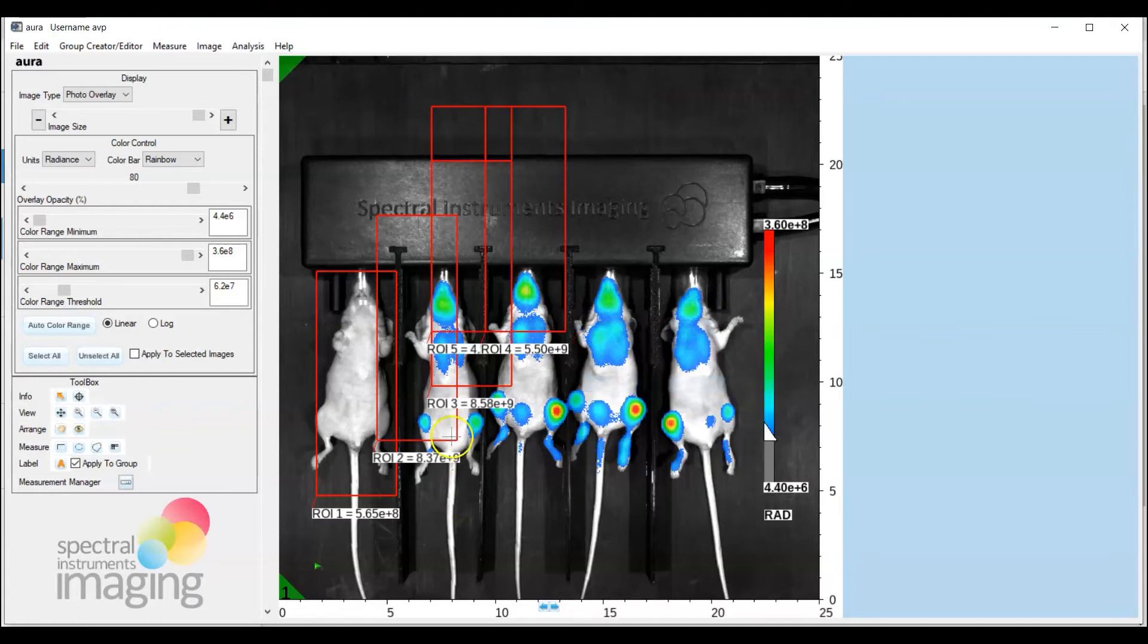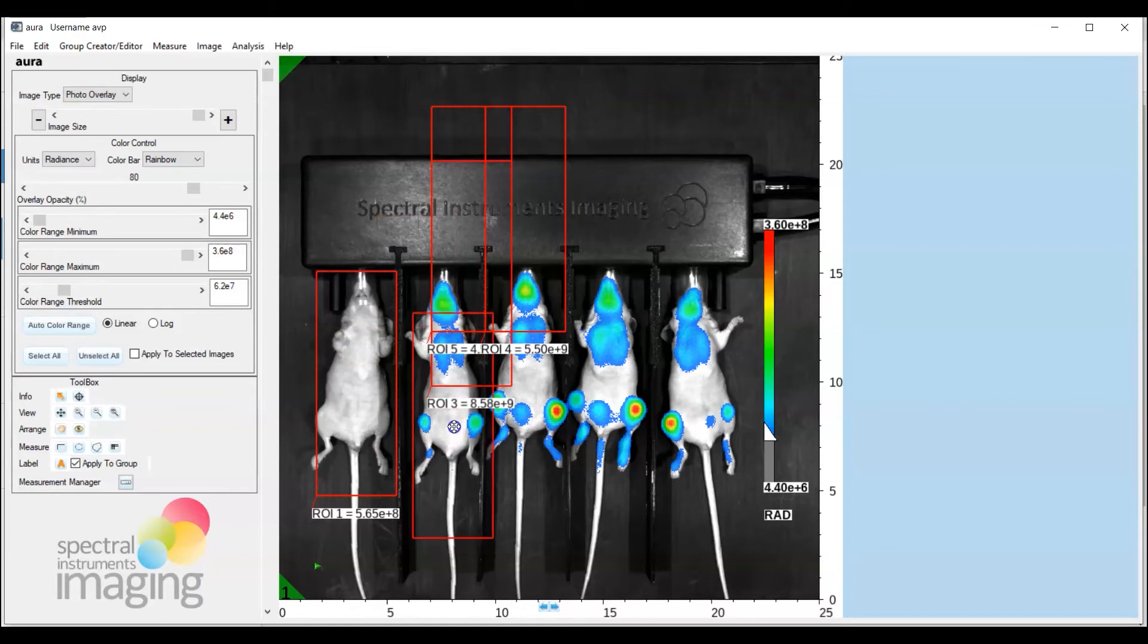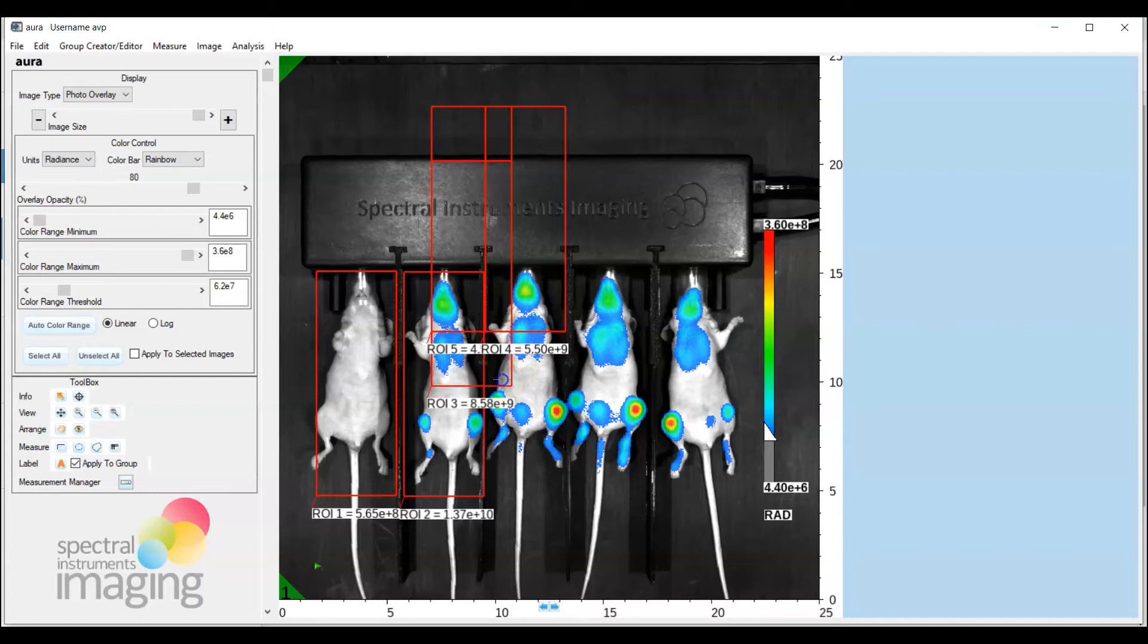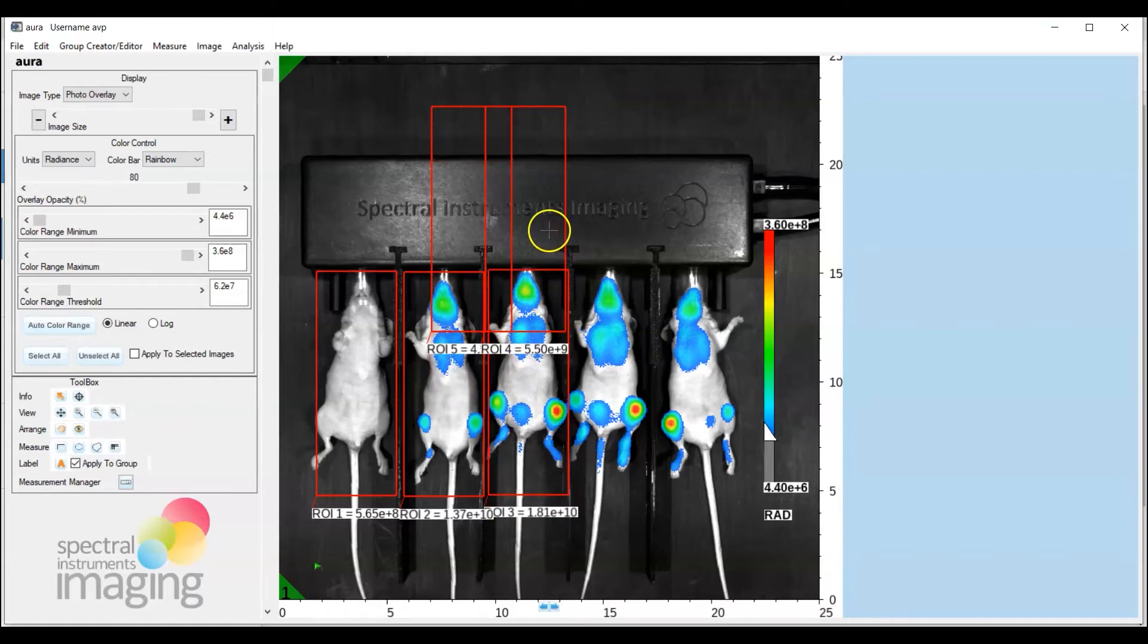Okay and now let's just go ahead and select the second ROI and drag it into place so that just involves a double left mouse click it's active and drag and we can repeat this for all of the ROIs.